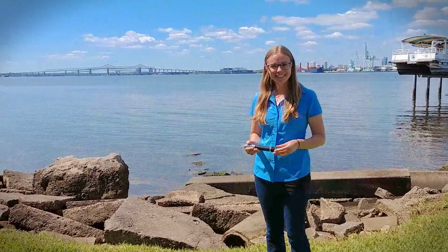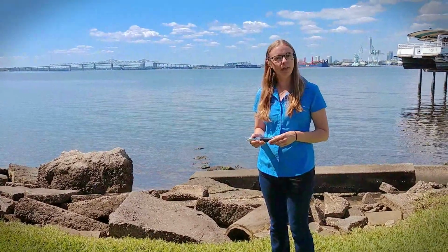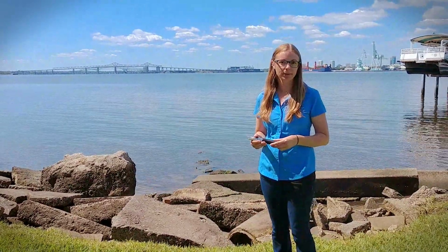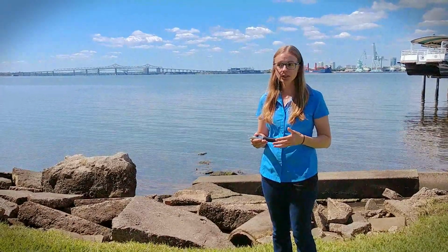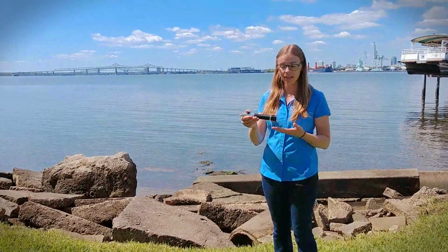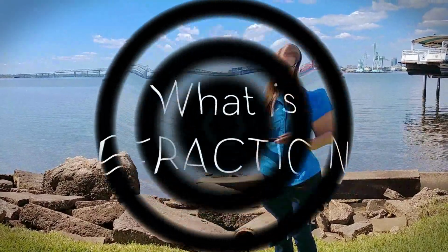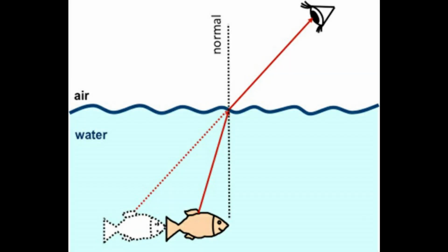Salinity is the saltiness of a body of water and has a unit of measurement called parts per thousand, ppt, or can also be described as grams per liter. Salinity can be measured through refraction using a tool called a salinity refractometer. What is refraction? Refraction is the bending of light through a medium. In this case, the mediums are air and water.